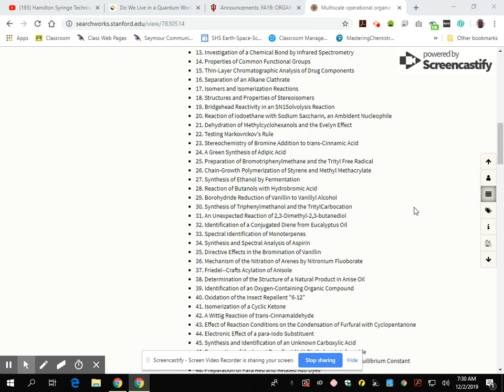So what you're going to do in the experiment, we're going to modify the directions. The experiments were ways you could determine between compounds, but I just want you to practice and see in reality that these compounds do match pretty closely the calculations that we've made where they absorb. So really all we're going to do in the final experiment, show up Thursday, you're going to pick a compound. All the compounds that I have selected will absorb in the ultraviolet spectrum.